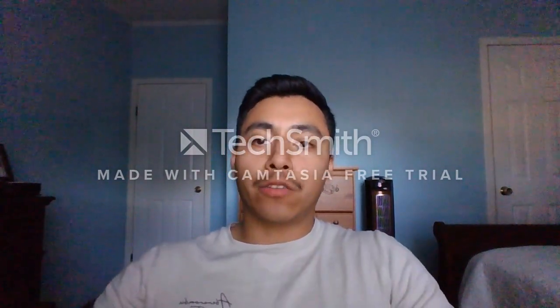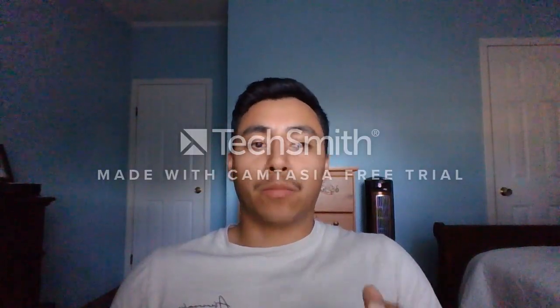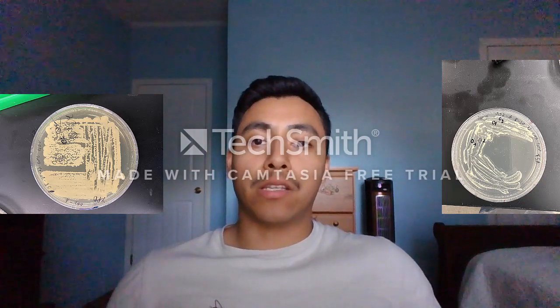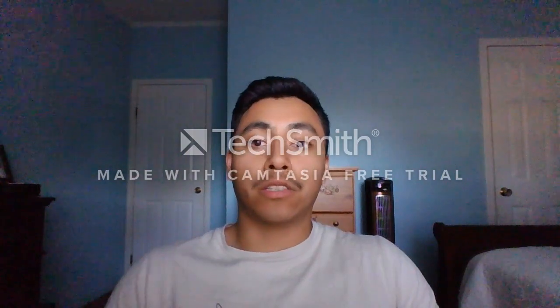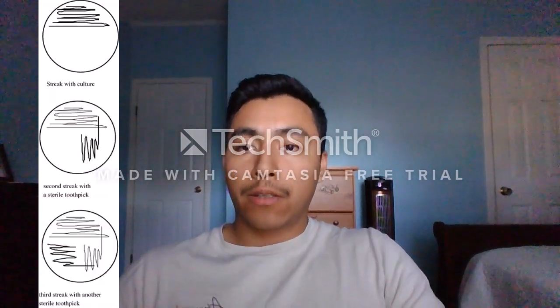But before moving on to our four rising rate experiment graphs, which are graphs that we constructed based on each sourdough starter experiment, I want to quickly demonstrate our procedure of plate streaking. When streaking our first plate, each partner was given a plate labeled YPD or TSA with a shared amount of starter given by the instructor. With a sterile toothpick, students were to streak the starter in this motion. Each partner was to continue this motion in a different direction with a new sterile pick for a total of 3 times. In the end, it should look like this.